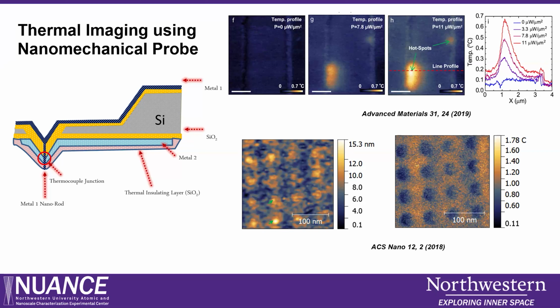But here, a few years back, we worked with a company and came up with an innovative idea of using a nanoscale probe, where the thermocouple is within the probe. Within the hollow probe, a metal wire extends to contact the surface. So the thermocouple is not influenced by any temperature variation across the surface, because it is within the hollow core. You can read these articles for more. The whole idea is that you can measure thermal conductivity with a resolution down to a few nanometers.